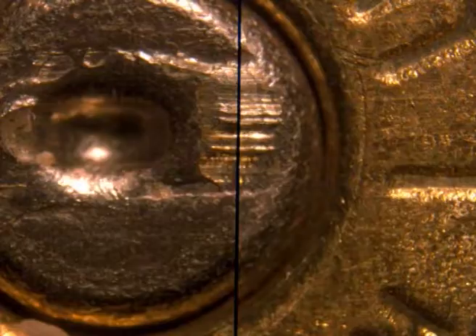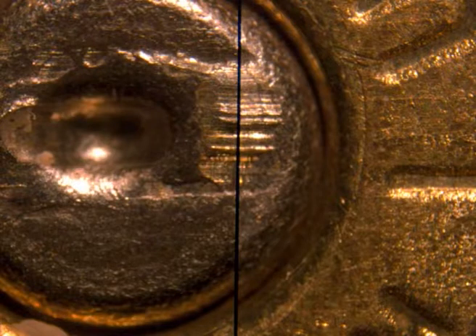While most comparison microscopes have some form of photographic system for recording the striation marks, which are shown in figure 3 on your screen, this is only of any real use in tool mark examination, since stria present on a flat surface may easily be photographed, but striations on bullets are on the circumference of a curved surface, and only a small portion of this can be adequately represented in focus on a single photograph.